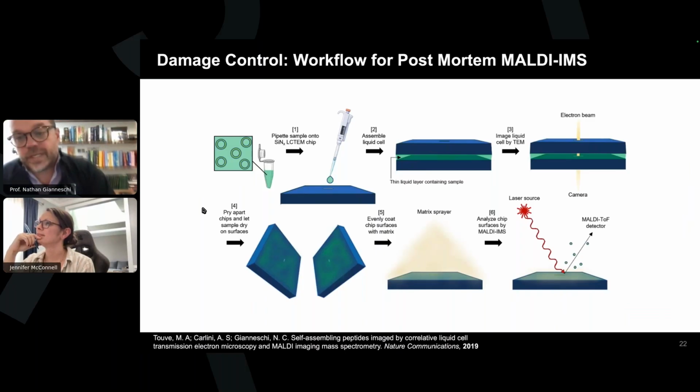So we have a lot of these conversations with potential collaborators where they'll say, well, I've got this really cool system. We've made this self-assembled material. And those are the types of things we'll look for, right? Well, what's the size of it? If it's a 2-micron scale rigid particle, we can't put it in the cell, right? So there are cell dimensions, right? We know we want to be on those hundreds of nanometers, or it can be squished down. So the emulsion particles can be larger because they can squeeze in between, let's say, the plates. So there's the size of the particle, then there's the beam sensitivity of the particle, and then you can start interrogating something like temperature dependent structure over time.